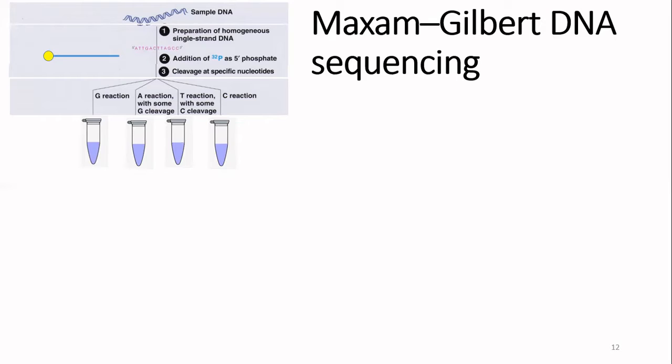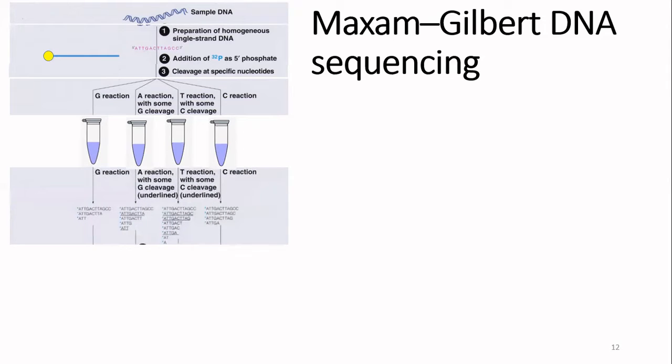Obviously, here we don't know the DNA sequence, but for example, we'll think it's the sequence given above. If you get this sequence, you can see at the 4th place, there is a guanine nucleotide, guanine base, and also in the 10th place.